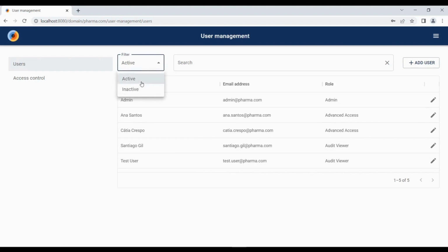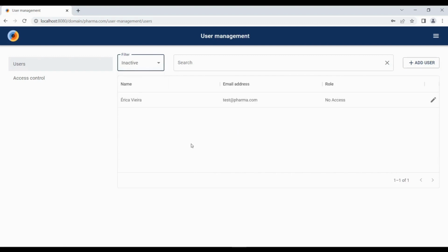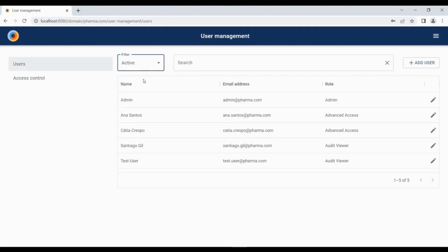The active users are the ones using licenses and that can currently access the system. Inactive users are the ones that were part of the system once upon a time, maybe they left your organization. Because of the audit trail that requires information on users that might have left, you cannot really delete users, but you can inactivate them so they are no longer using user licenses.